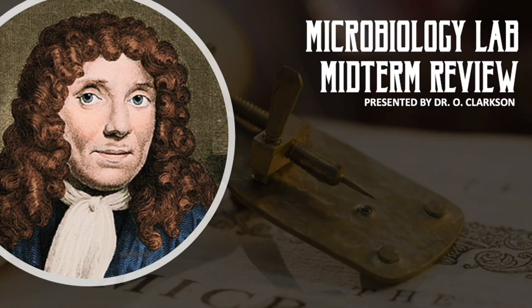And then know that basic stains are going to be your positive stains. Acidic stains are going to be your negative stains.